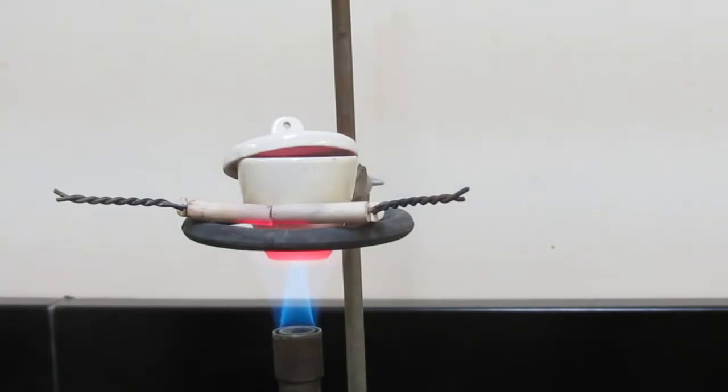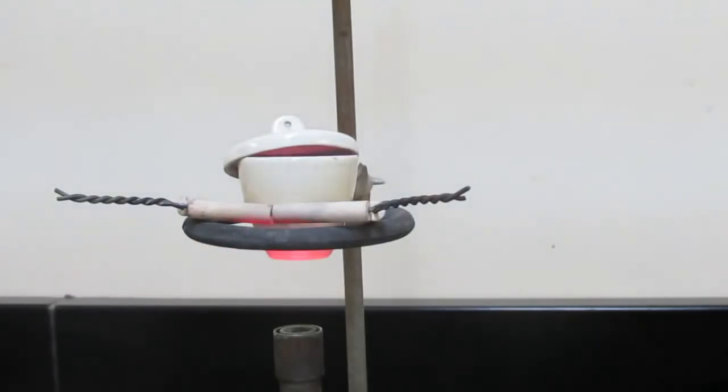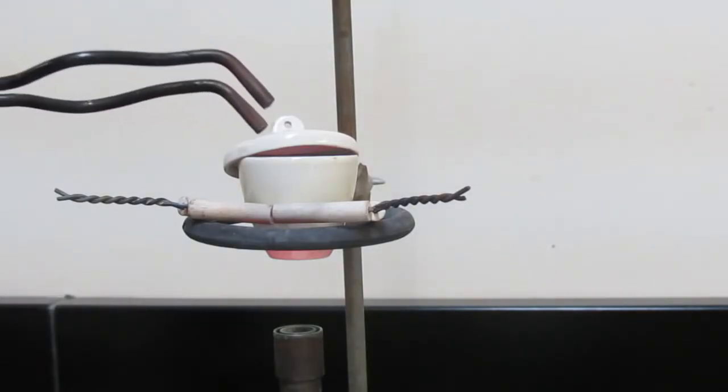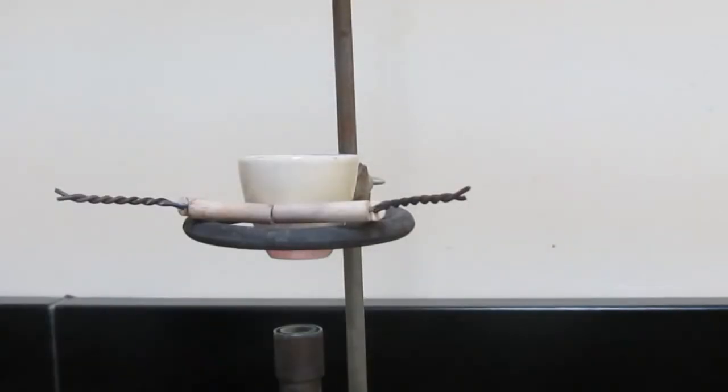In the interest of time, let me go through what we'll be doing here in just a moment. After this is heated, we'll allow it to cool for about 3 minutes. We can remove the lid at this time. Once again, please use your crucible tongs. This is very, very hot at this time. You will burn yourself quite badly if you're not careful. Let's take a look and see what we have down there.